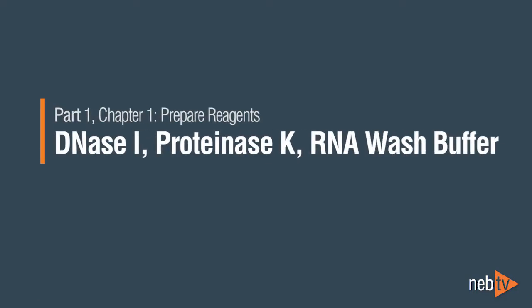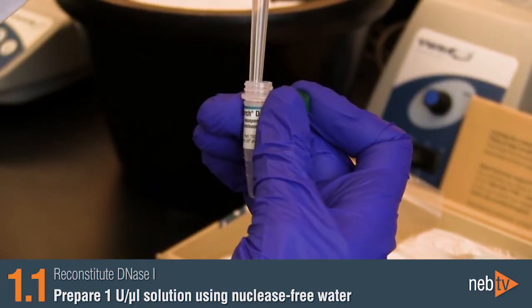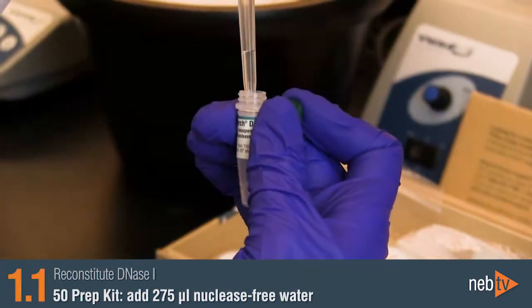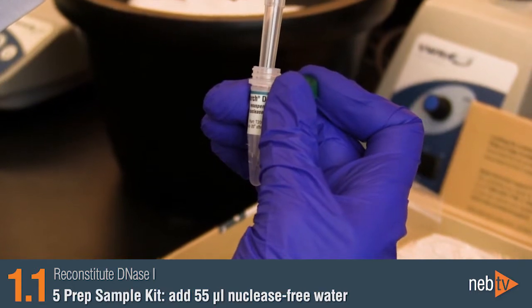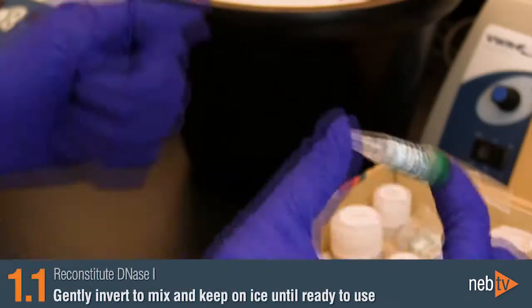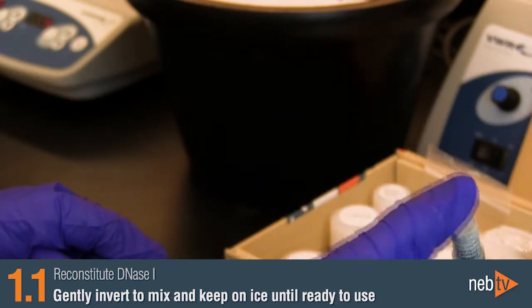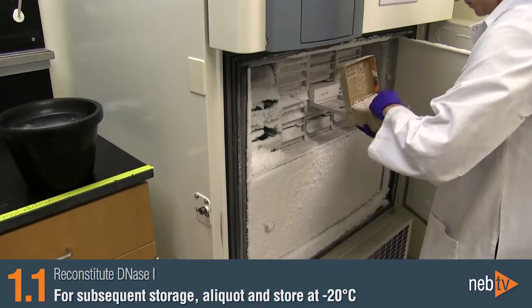Next, we'll prepare the following reagents. Reconstitute the DNase-1 by adding nuclease-free water to bring the final concentration to 1 unit per microliter. For the 50-prep kit, add 275 microliters, and for the 5-prep sample kit, add 55 microliters. Gently invert to mix, do not vortex, and keep on ice until ready to use. For subsequent storage, prepare aliquots and store at minus 20.